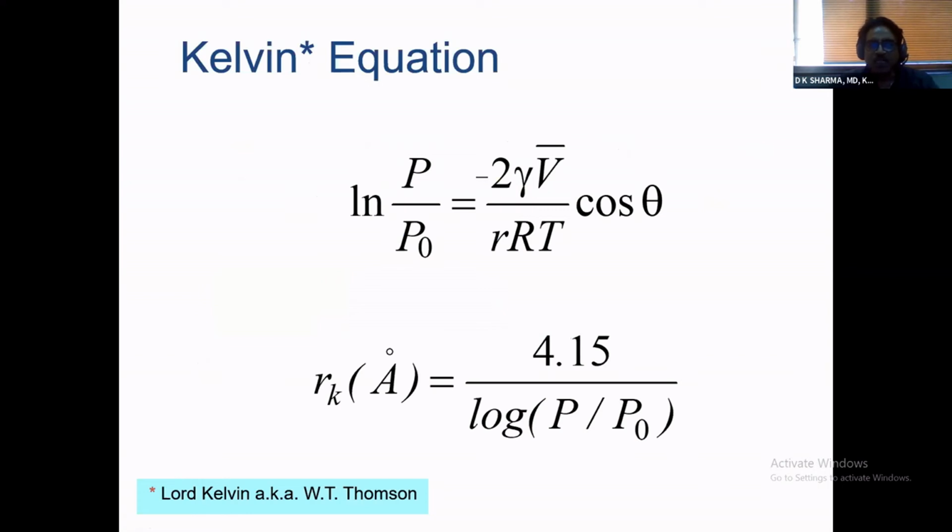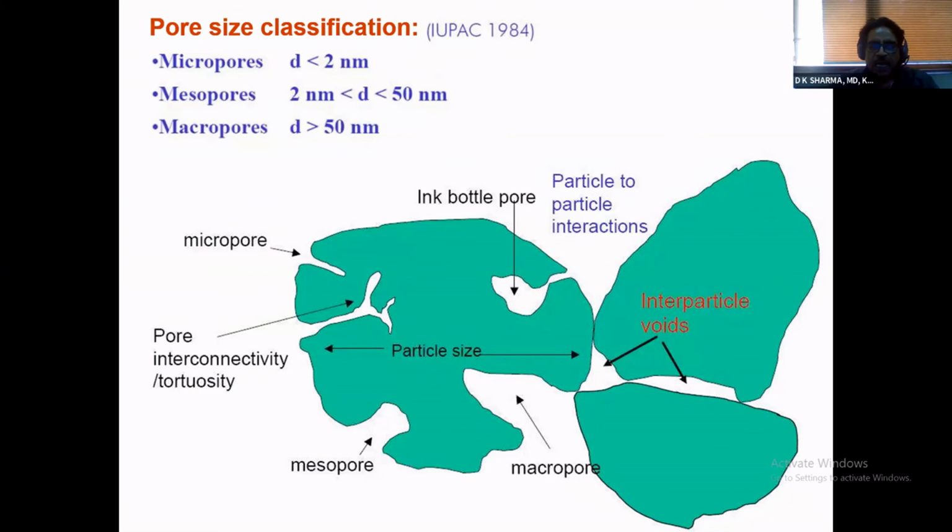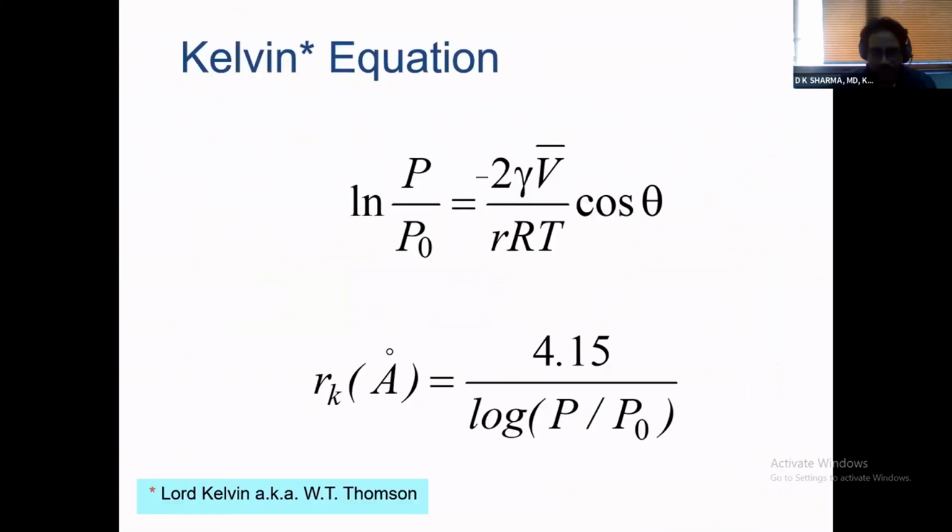Well, Kelvin equation. Okay, I think I have missed a particular slide, just to show how the pore looks and how it is filled. We have a cylindrical pore.